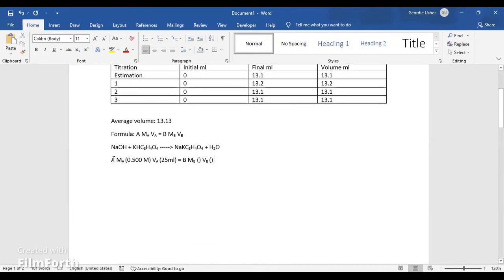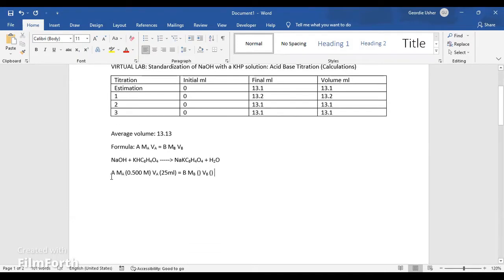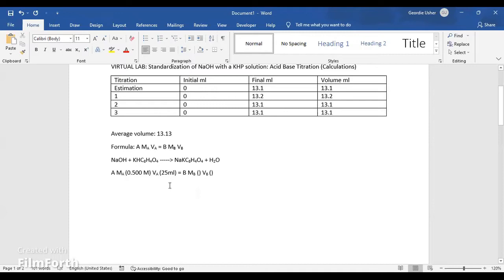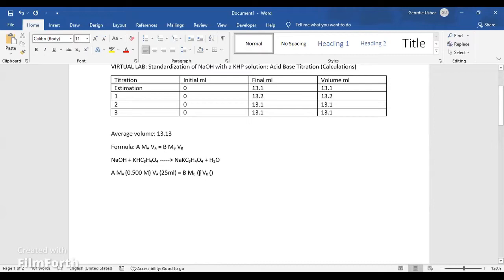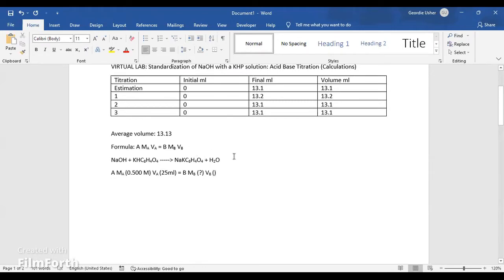We already know that the molarity of the acid, which is 0.500, and the volume was 0.025 liters, but we converted to milliliters, which gave us 25 milliliters. It's equal to the molarity of the base, but the molarity is unknown, so this is what we will be finding. And we do know the volume, which is 13.13.